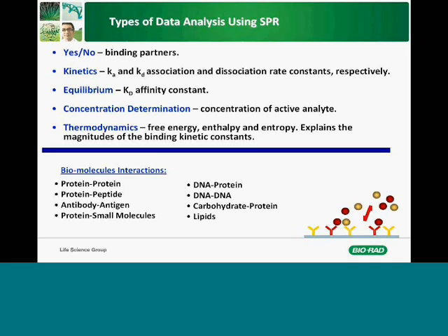If they are big enough, the reaction will reach equilibrium or steady state, and then you can determine the affinity constant. Eventually you can compare these two affinities, one from the kinetics and the other from direct equilibrium. Comparing these two values is another good indication of the quality of the results.